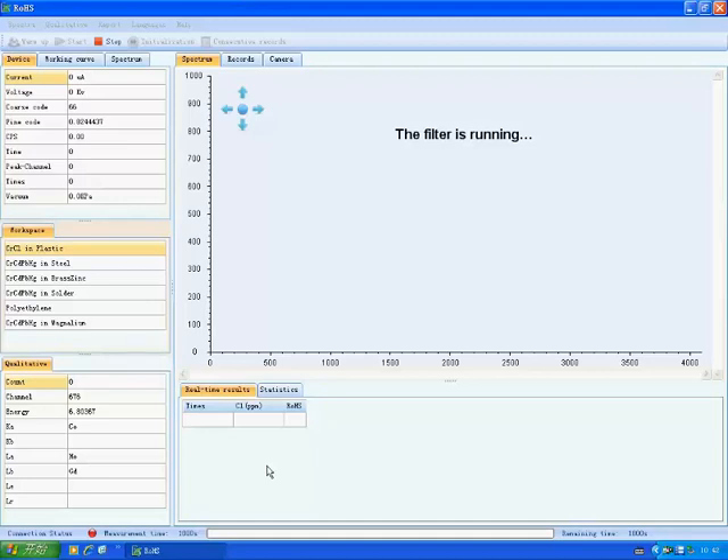When it is measuring, the filter and the collimator are moving to a proper place automatically, and the spectrogram is displayed. After warming up, a message indicating the measurement is completed pops up.